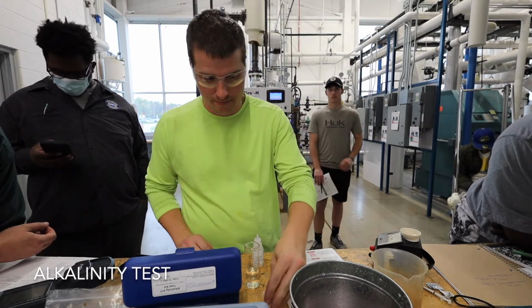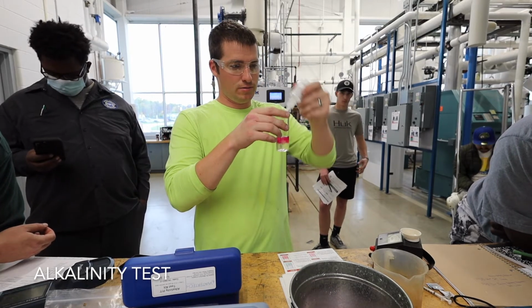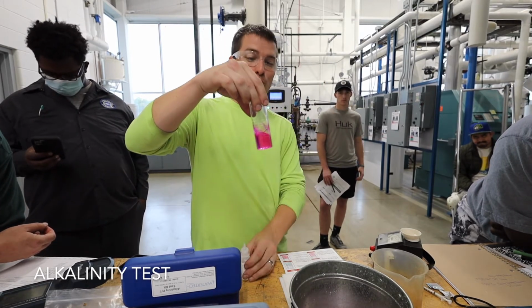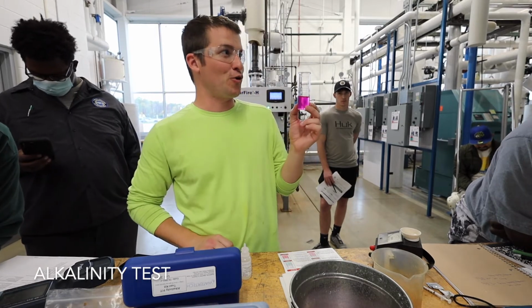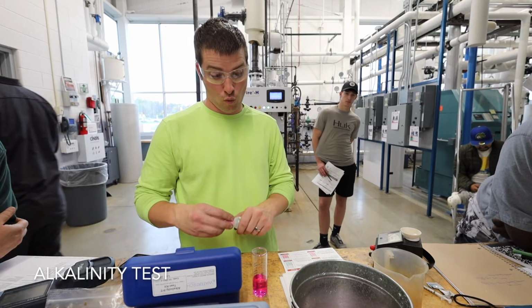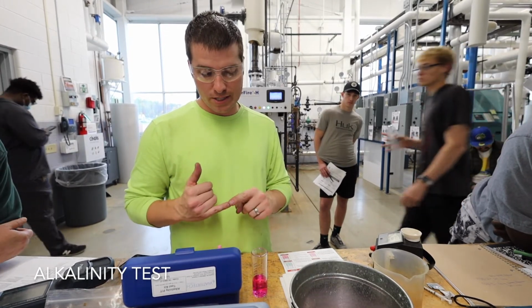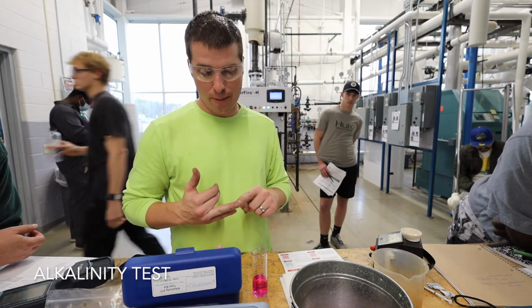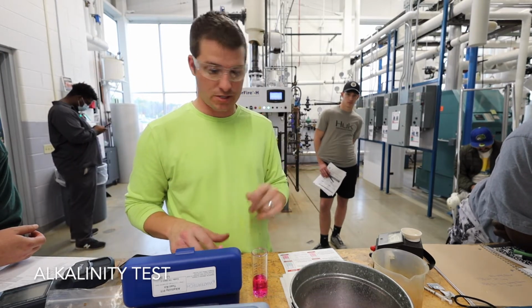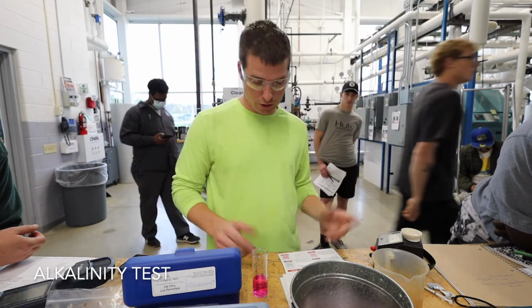All right, so 3 drops of this should turn pink. In a normal boiler, if things are going well, it should turn pink. If it doesn't after that step, then we have to dig into why that is happening. A lot of times that would be too low a conductivity or not running the proper amount of sulfite specifically. Sulfite will drop your alkalinity if you overfeed it. Okay, so it turned pink.